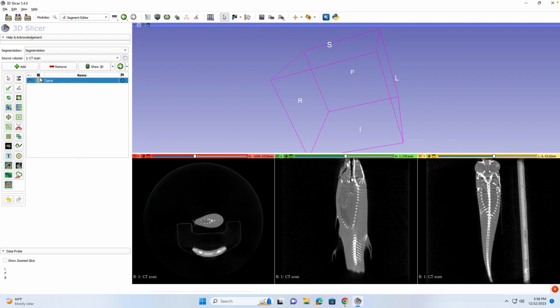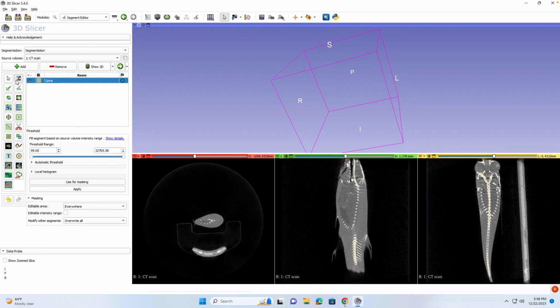And so the first thing that we're going to look at is the different ways to segment. I have some in my workflow. It just shows different methods that you can use to segment the spine of the fish, but I'll just run through a few real quick, and then we'll get to the one I think is most efficient, and the series of steps that you need to take using that to get to where the final image is just the spine, right? So first thing is threshold.